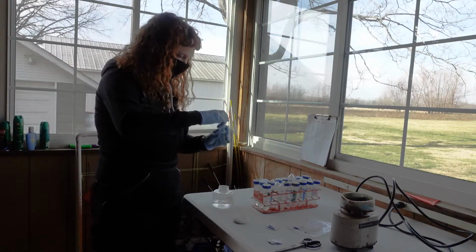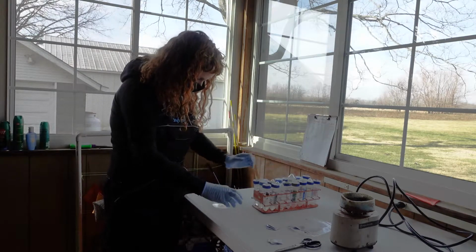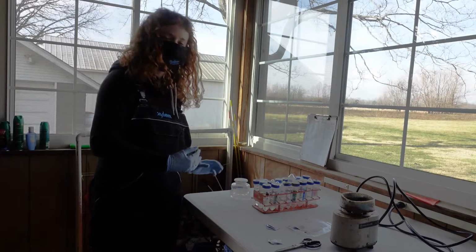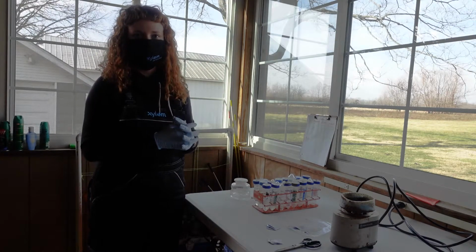All right, so I finished sample number 1. Usually I will fill a couple at a time. Maybe I'll fill sample number 2 and 3, and then I'll move on to the reaction stage.